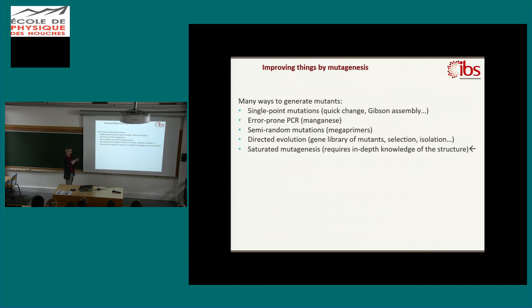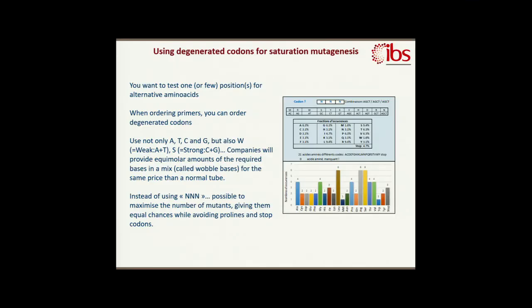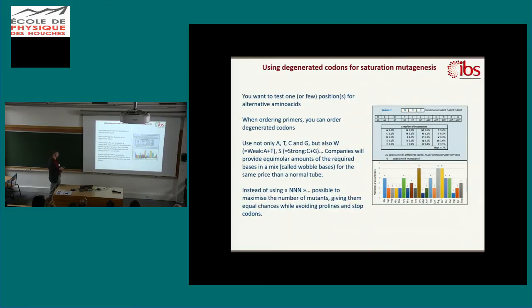But what if you identified on the structure a given position that you want to mutate for whatever reason? There's a very easy way to do it that I like. It's using degenerated codons for saturation mutagenesis. In fact, you get to know that when you order your primers, you can not only use A, T, C, and G, but also all these letters that are given here, that are, for example, W for weak, which is giving you the same proportion of A and T because it's weak interactions. Strong, C and G, S. You have all the other ones. So they are coding for one, two, three, four different combinations.